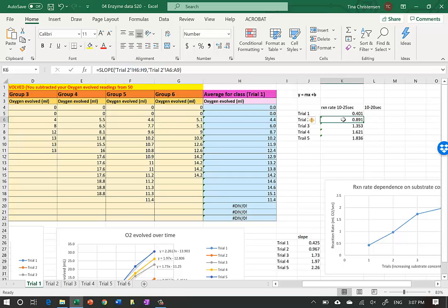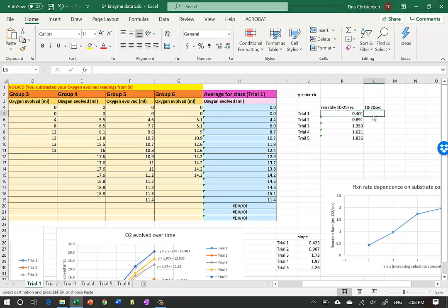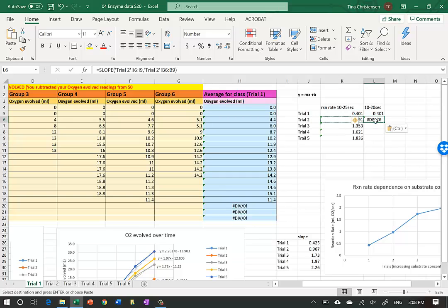If you drag a formula with dollar signs, it will always refer to the original cells. Without dollar signs, dragging shifts the references - for example, it might refer to an empty column and give a division by zero error. So with dollar signs, it will always refer to the original, making it easy to edit just the row numbers.